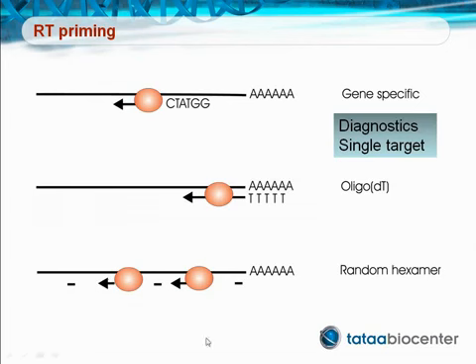An alternative is to use random sequence primers. Random sequence primers hybridize to all accessible regions, effectively reverse transcribing all RNAs, including fragmented RNAs and structural RNAs. Random sequence primers are often hexamers but can be longer. Longer primers are preferred when reverse transcription is performed at elevated temperature.